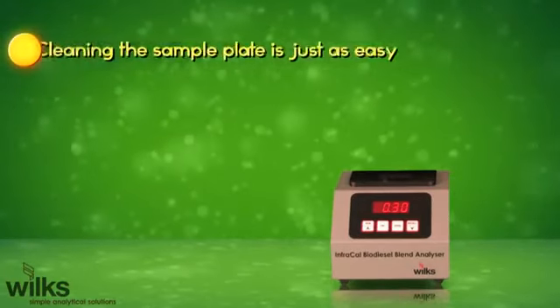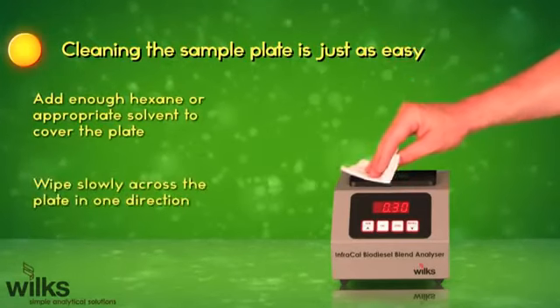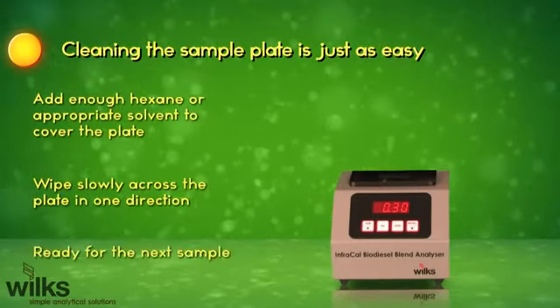Cleaning the sample plate is just as easy. Add enough hexane or appropriate solvent to cover the plate. Wipe slowly across the plate in one direction, ready for the next sample.